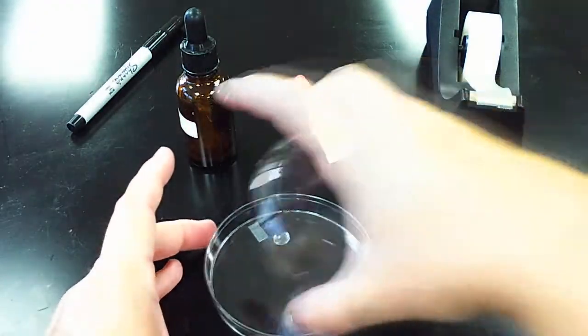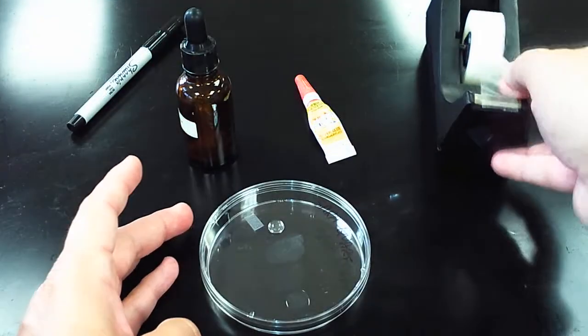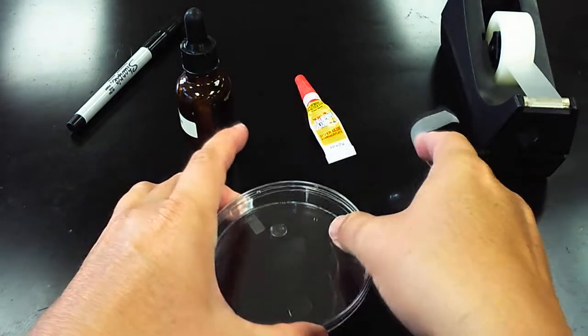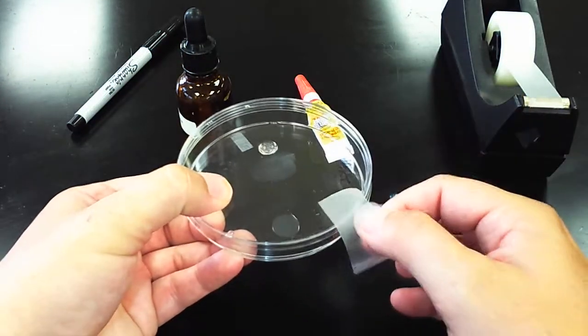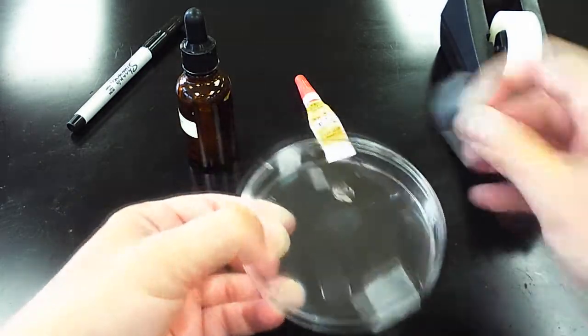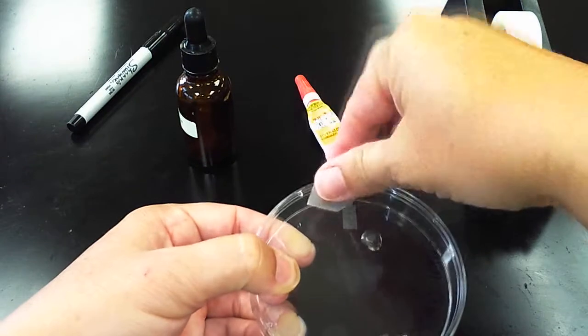Then immediately put the lid over top and take some tape to close it. I'm going to try and keep it flat so my super glue and water don't run together, and I'm going to tape my lid closed.